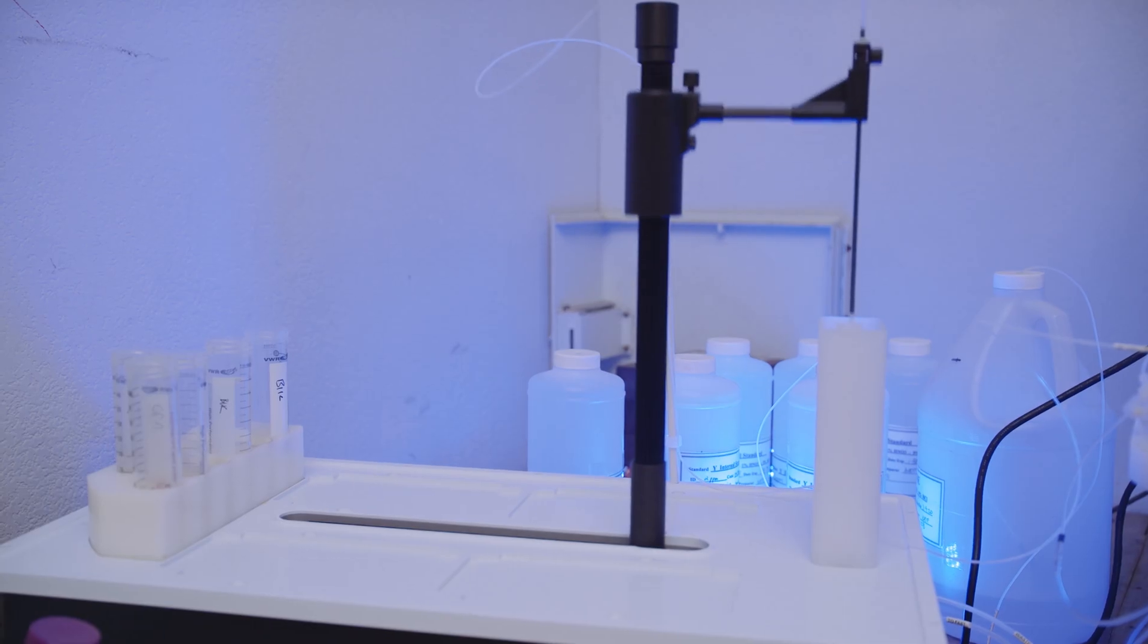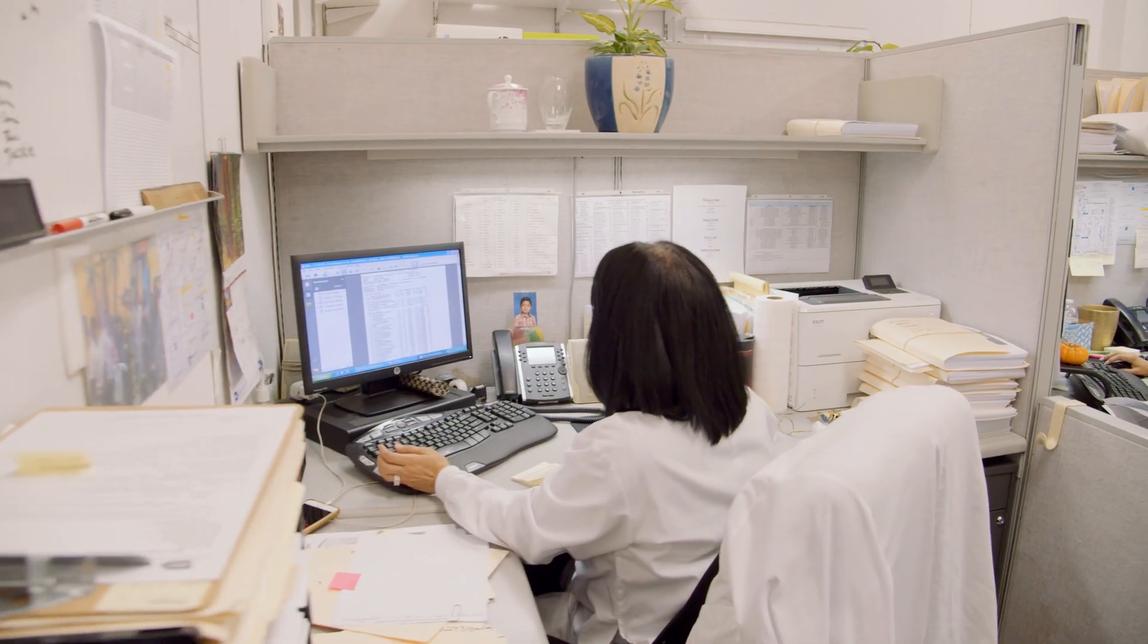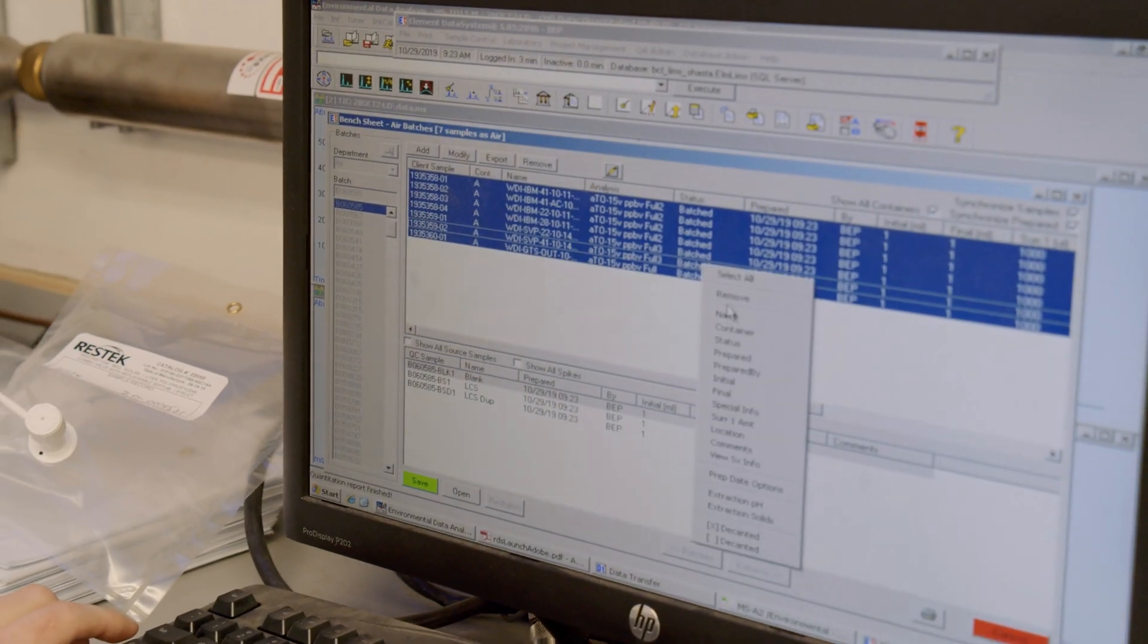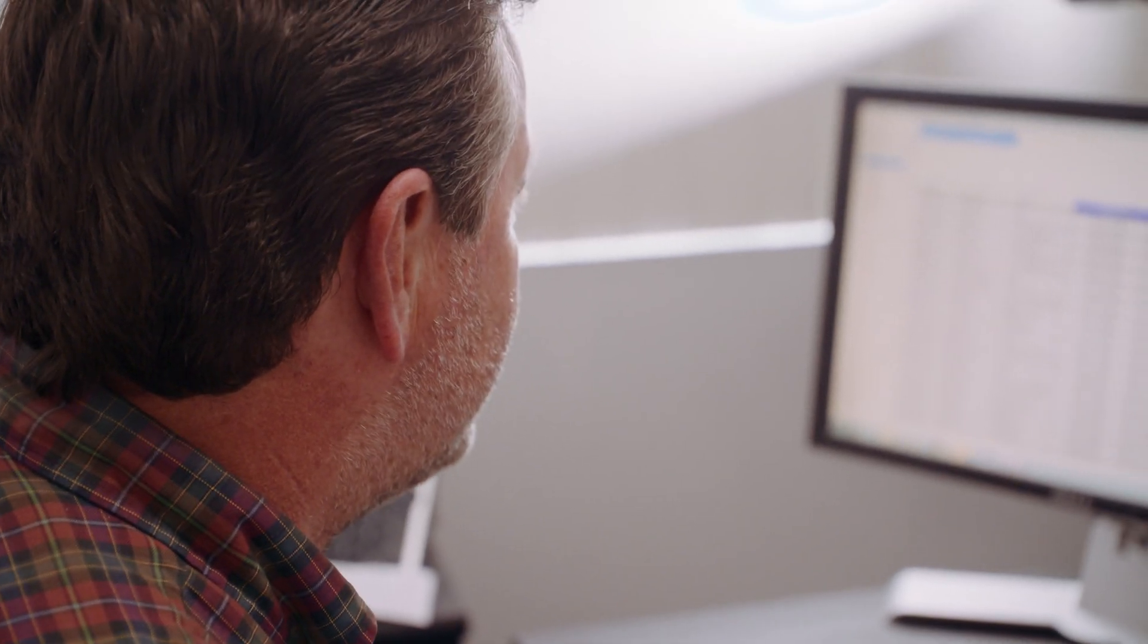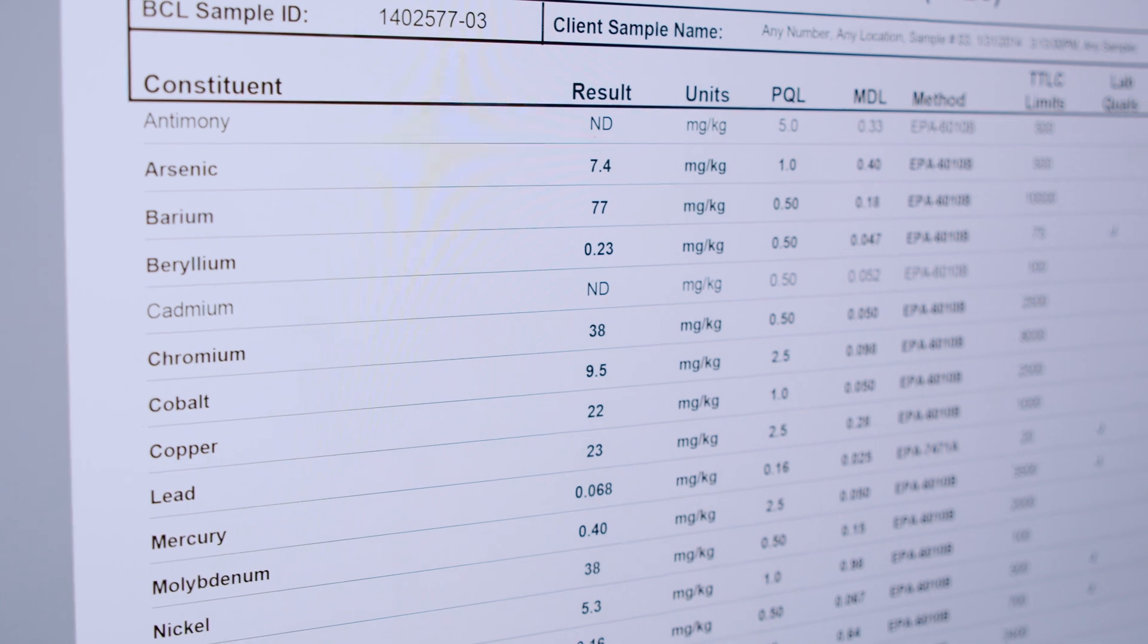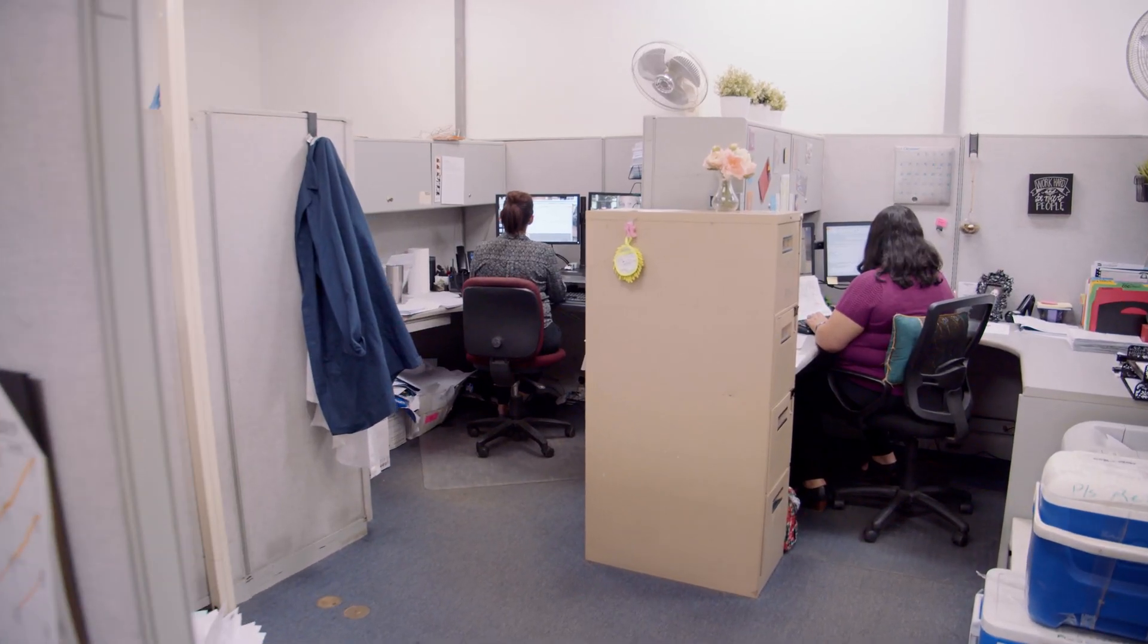After all samples have been tested, our analysts will upload the results to Element, a software program. The results will be reviewed by our department supervisors and then reported to the client. Advanced data packages are available from our quality assurance and quality control department.